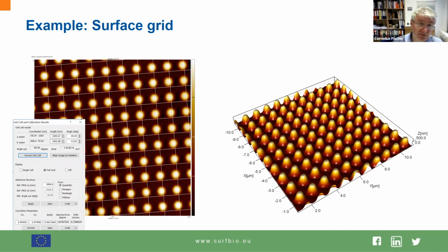So this is a simple surface pattern, a machined one. It has a regular structure. And of course, for them, you can do all those things that I mentioned earlier. You can calculate orientation. You can calculate a grid pattern, the grid constant length in X and Y direction, what is shown here. And big surprise, they are quite similar, 1 micron in X, 1 micron in Y direction.